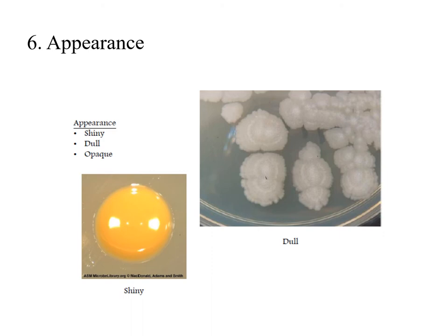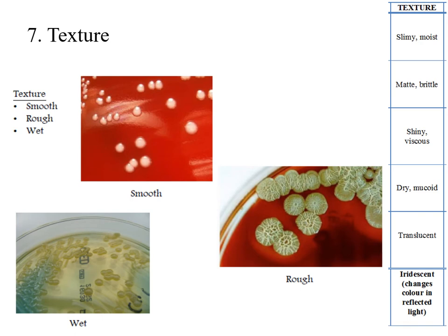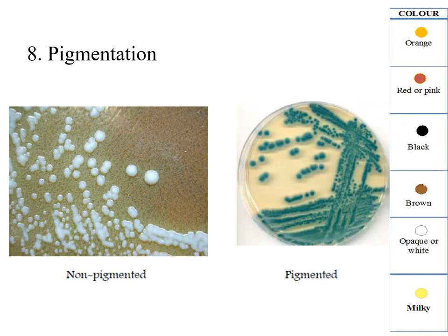The appearance of a bacterial colony can be shiny, dull, or opaque. As we can see here, this one is shiny and this one is dull. When we talk about examples of bacterial colonies, we'll show many that are opaque in appearance. For texture, we have smooth, rough, and wet textures. We also have shiny viscous, dry mucoid, and translucent textures, and we'll show different types when we discuss examples.